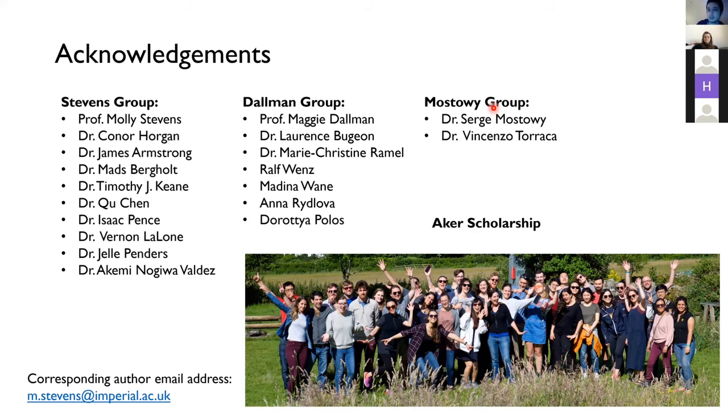I'll get things started. So can you maybe just first of all talk a little bit about some of the limitations of Raman and maybe the comparison between using Raman and using more conventional fluorescence imaging? If I'm a biologist and I want to have a problem to assess, how would I decide which technique to use? Yeah, I mean, there are several important limitations to Raman. I think the two really important ones are the sensitivity and the time it takes to acquire an image.